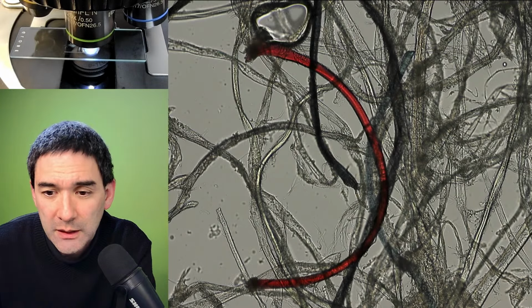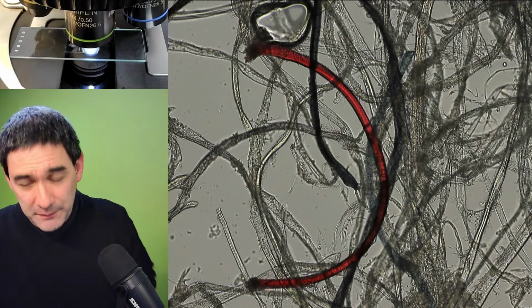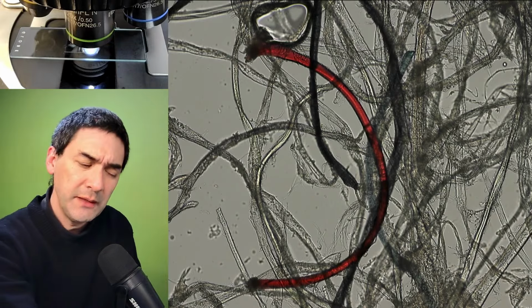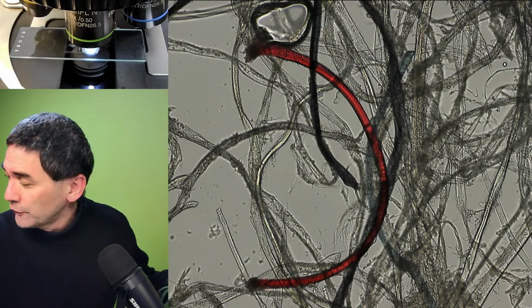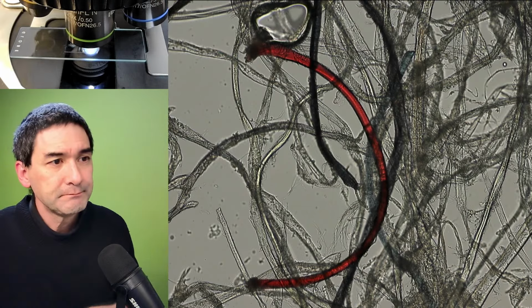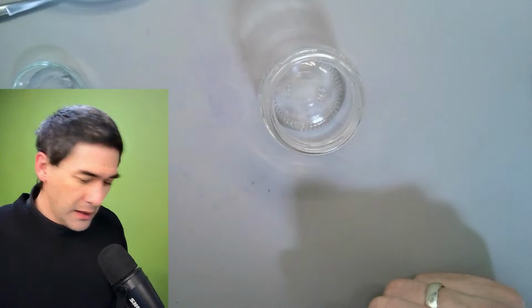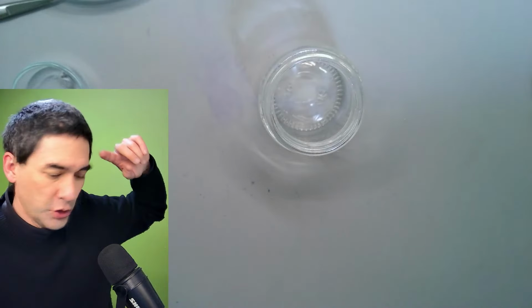Let me quickly have another check. So you know what I'm going to do now? Because I decided to occasionally show some living things as well. Some people want to see some living things. So what I'm going to do today, in preparation for next week, is I need a small jar, which I've got over here. So I'm going to make another topic change for the last couple of minutes. I'm going to show you how I make an enrichment culture.